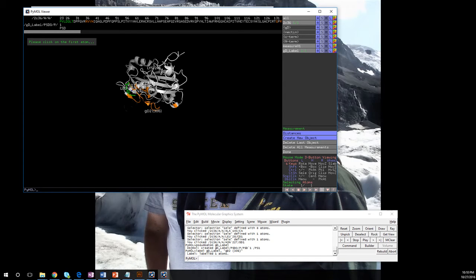I can use the set label position moniker, and that will move it around. There's a way to make that. I need to find out where that is, but I can move it so that if I do this, it's going to set all of them that size or in that position. But there's a set label size and a set label position that you could use to very quickly move it to where you want to go.